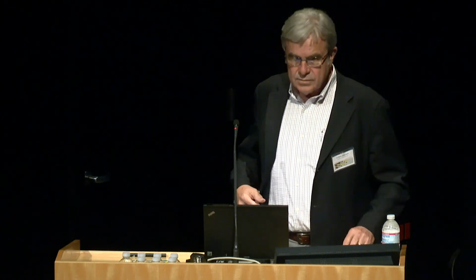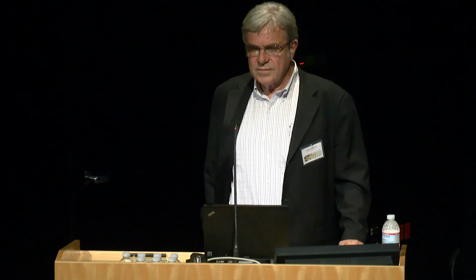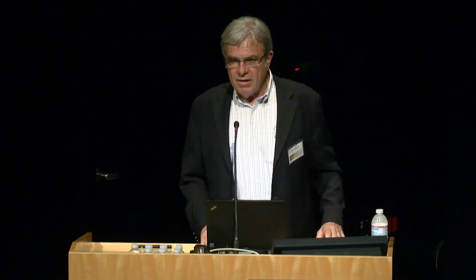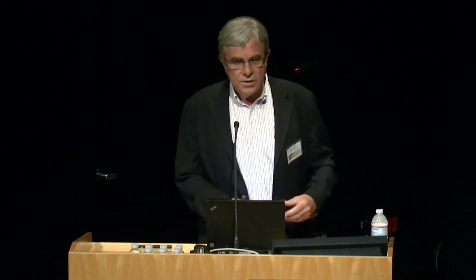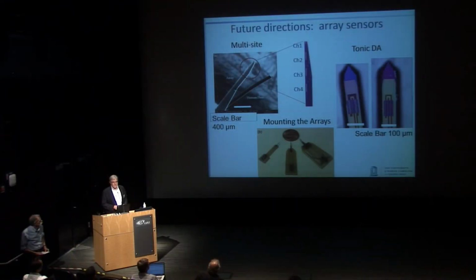Yeah, good. So what you call the background may be important too. The tonic dopamine, do you see how that is being regulated over a longer time scale in terms of the overall? You're exactly right. We're seeing half of the dopamine story. We see what happens when there's a surge or burst of firing of dopamine neurons. But that background signal is really hard to know what it is. And the sensor over on the far right, it says a tonic sensor, is something that we're working on right now.